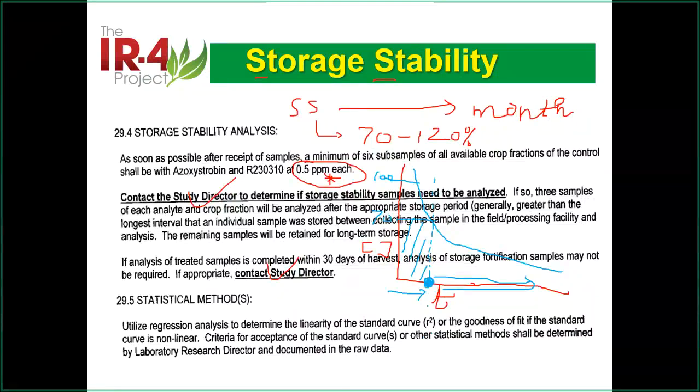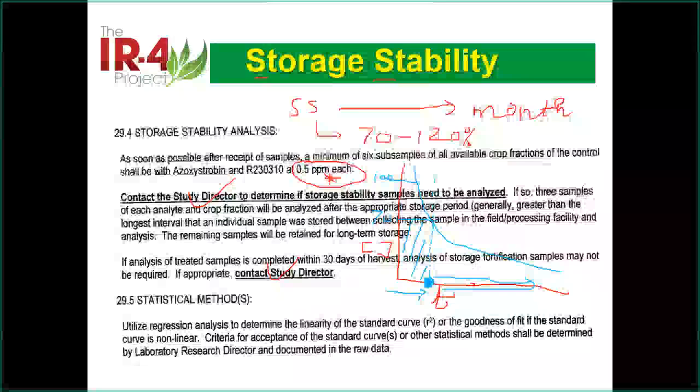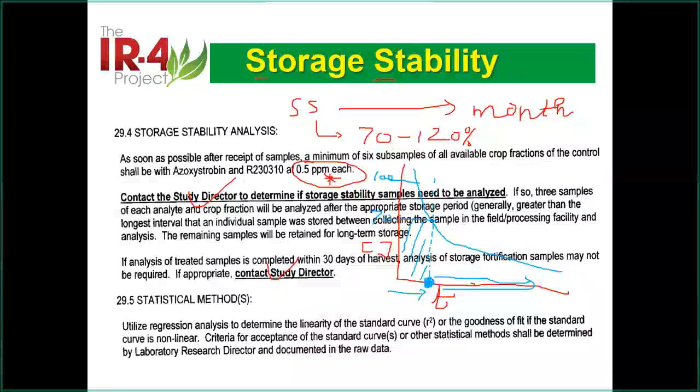But it depends on the chemical. Like I just mentioned, the one chemical that lasts only how many days? Maybe less than 7 days. Okay, I do have a question there. The question is, we report the mean of both injections.